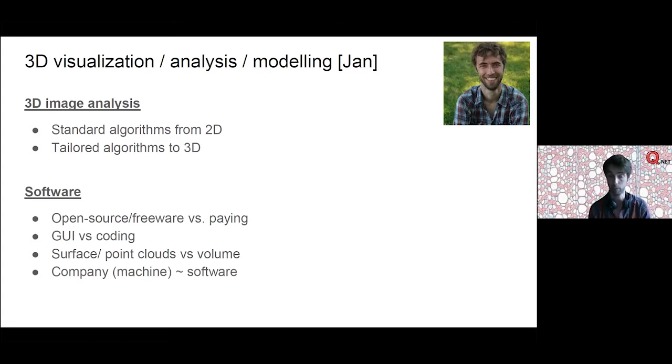And then, as mentioned by Tom as well, any kind of equipment that is capable of producing 3D imagery, so CT scanner, CLSM, SEM with FIB or FIB-SEM, most of the time these vendors, these companies, offer their own product for analysis, visualization, and in some cases, but hardly ever, also for some modeling. So this is certainly not a full list of all software packages available, or of all literature available on these particular questions that we got on the 3D story. Next slide, please, Giulia.